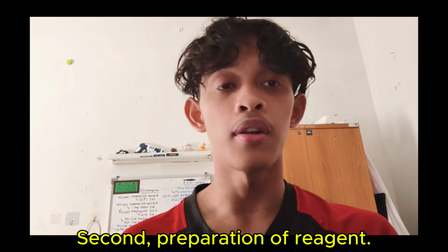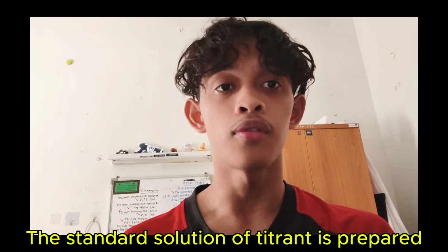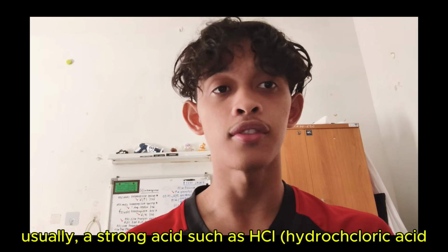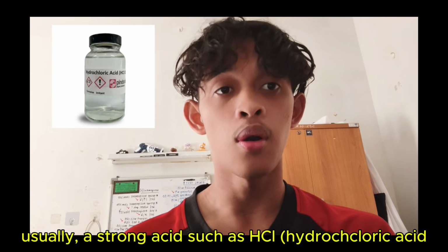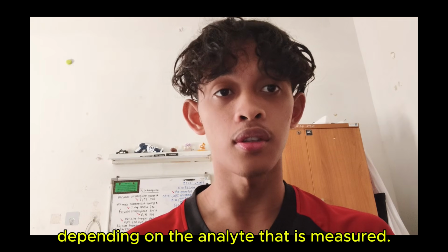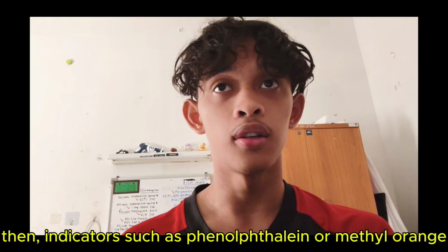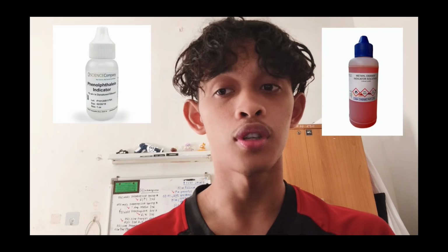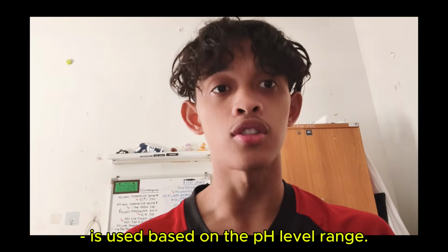Second, preparation of reagent. The standard solution of titrant is prepared. Usually, strong acids such as hydrochloric acid or strong bases such as sodium hydroxide, depending on the analyte that is measured. Then, an indicator such as phenolphthalein or methyl orange is used based on the pH level range.